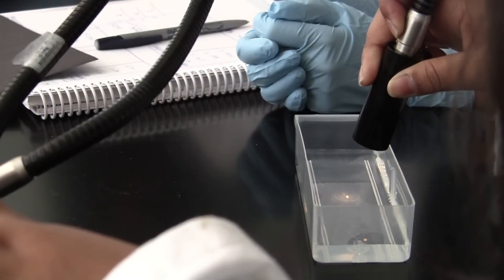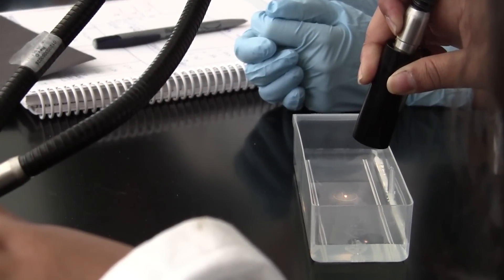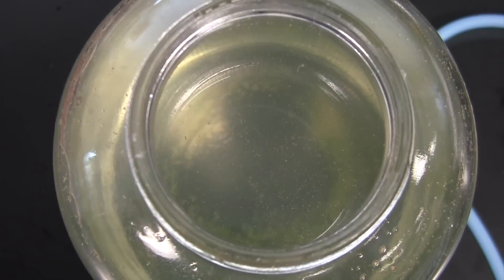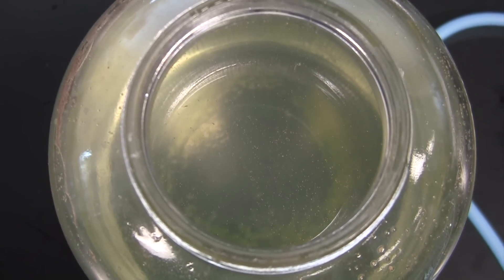Today we actually put the shrimp in a tub and exposed them to the different intensities to see which they would respond to the most.